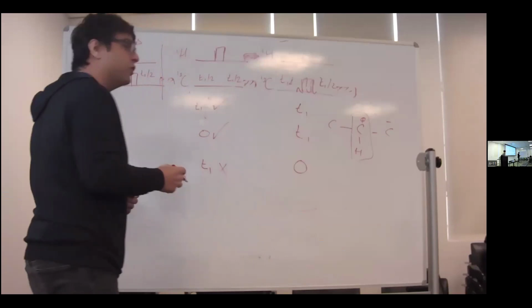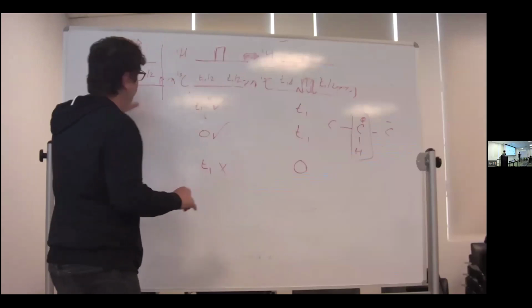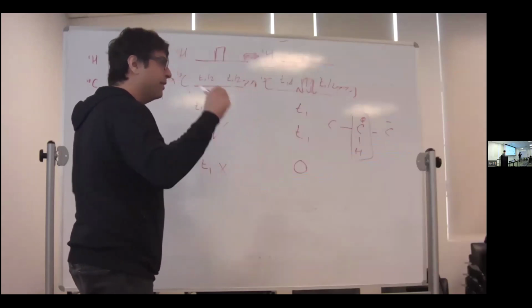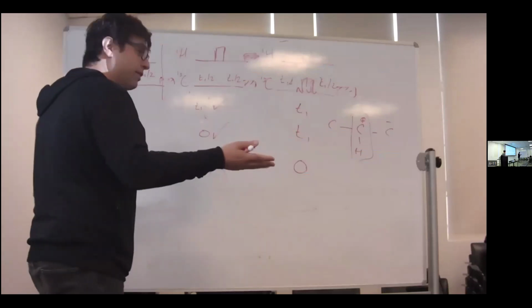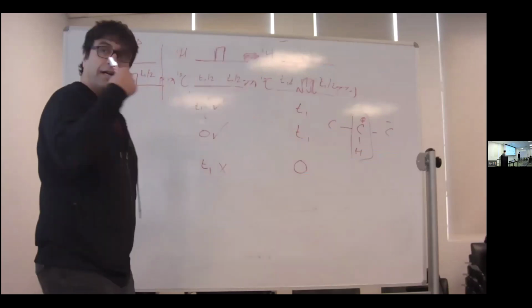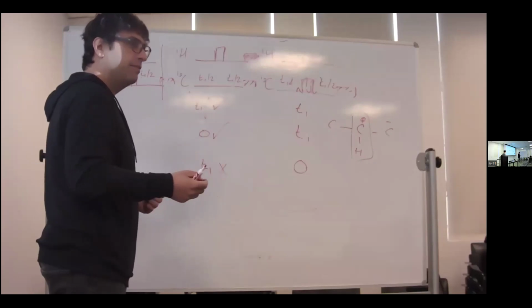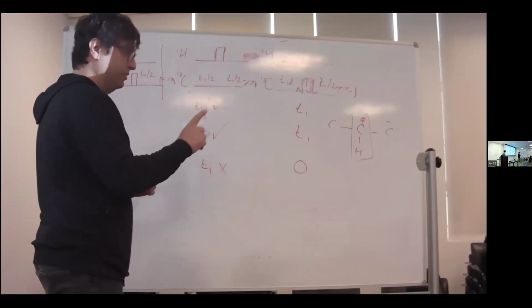But in NMR, you can control time with refocusing pulses. So let's just say we are stuck in a universe where we have a constant time. You don't get to increase it. How could I possibly get a signal? Let's just do chemical shift. How would you design an experiment by which you could still get a signal that's modulated by, for example, cosine omega t1? You're not allowed to increase the time. Time is fixed. But you're allowed to move pulses.